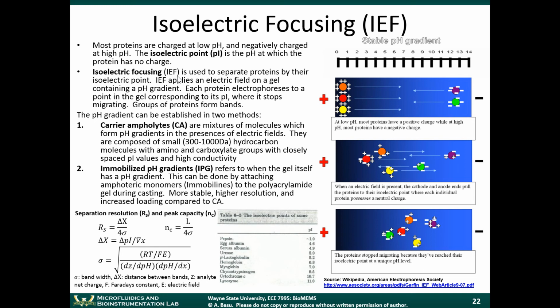Let's say two molecules have similar size and similar charge. We can't separate them out anymore, right? Let's say two proteins have similar charge and similar size. There's no way we can isolate them. So the more separation techniques we have that allow us to separate things by different properties, the more that improves our toolbox for being able to separate different biomolecular components.